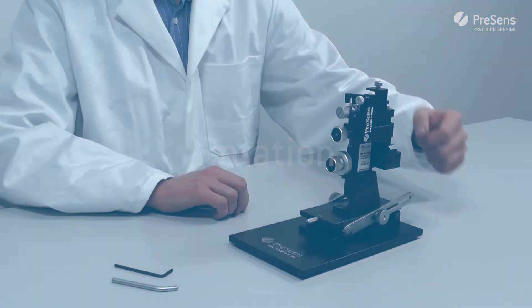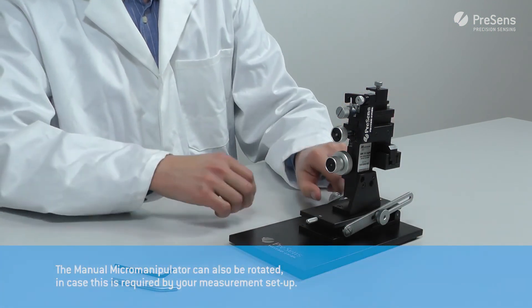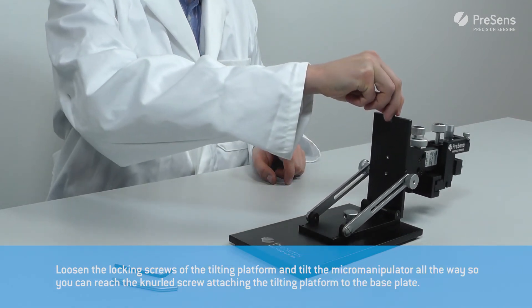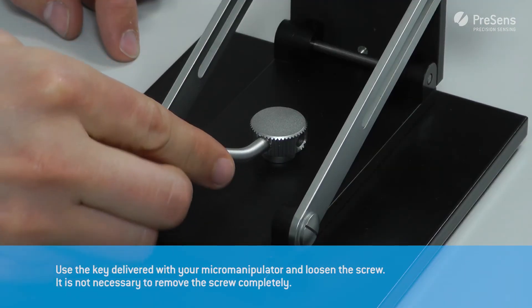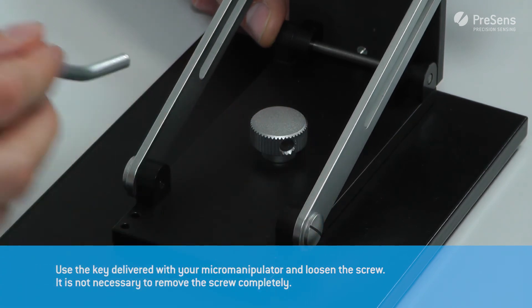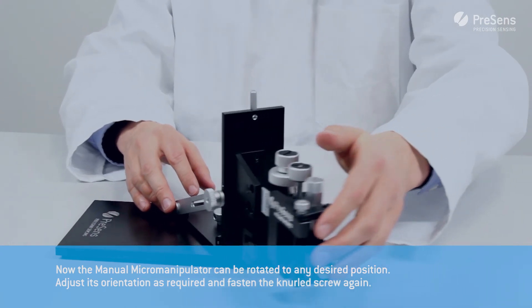The manual micromanipulator can also be rotated in case this is required by your measurement setup. Loosen the locking screws of the tilting platform and tilt the micromanipulator all the way so you can reach the knurl screw attaching the tilting platform to the base plate. Use the key delivered with your micromanipulator to loosen the screw — it is not necessary to remove it completely.